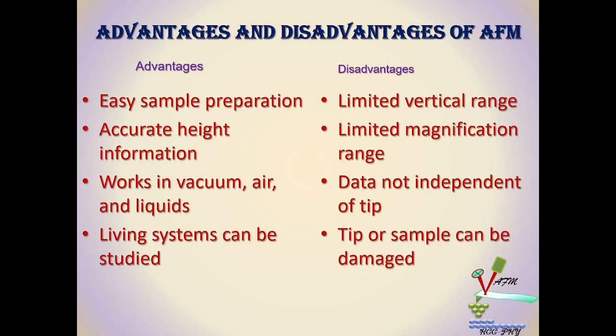And what are the disadvantages? There is a limited vertical range and limited magnification range, the data is not independent of the tip, and the tip or sample can be damaged.